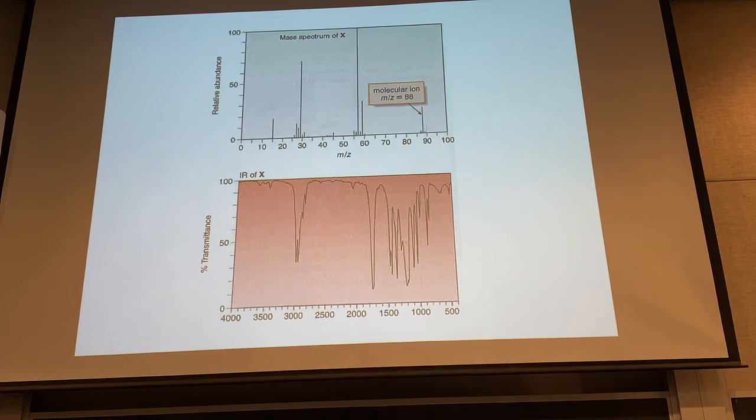Remember, there are sometimes these little isotope peaks, which are a little bit higher, and there is an M+1 peak you can kind of see right there. But what's the base peak? The base peak is the biggest one, the tallest one with the highest number of ion counts hitting the detector, right here at 57. And that's an ion we've seen before. And then some others down here.